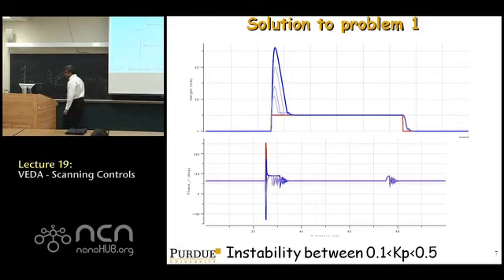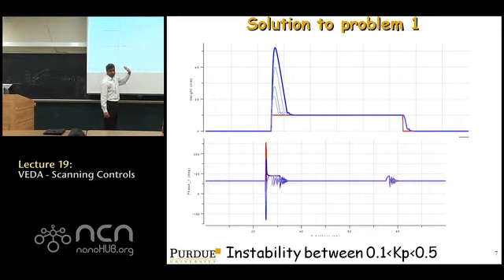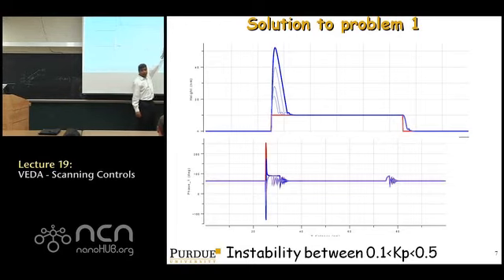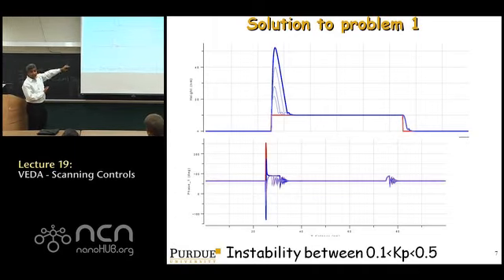Okay. So one other important thing I want to bring to your attention is, in the AFM controls literature, people talk about climbing up a feature and parachuting off a feature. So you see here that we changed the proportional gain, but the parachuting off is not very affected for some reason. It's not being affected too much by the choice of proportional gain. You see that? Whereas the climbing up is being affected a lot, the parachuting off is not being affected a lot. So the question is why? Why does that happen? That's an important point.